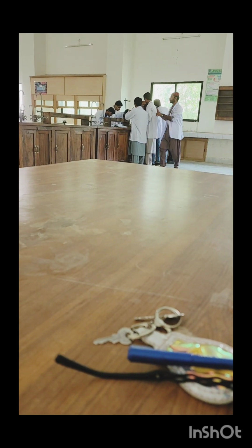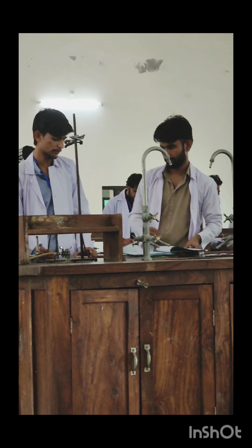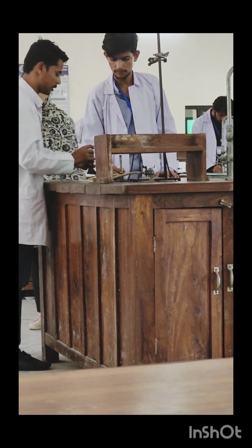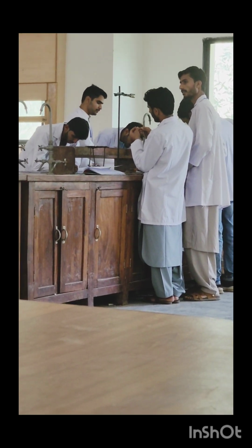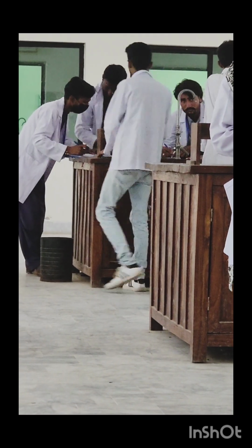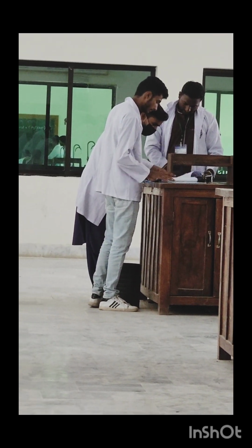It's again a very warm day. Unfortunately, whenever they have a lab, it's a very warm day. They are negotiating among themselves how to set up the assembly and everything. The other group is also engaged in designing how to set up the assembly. The last group, you can see, is involved in inputting the data.